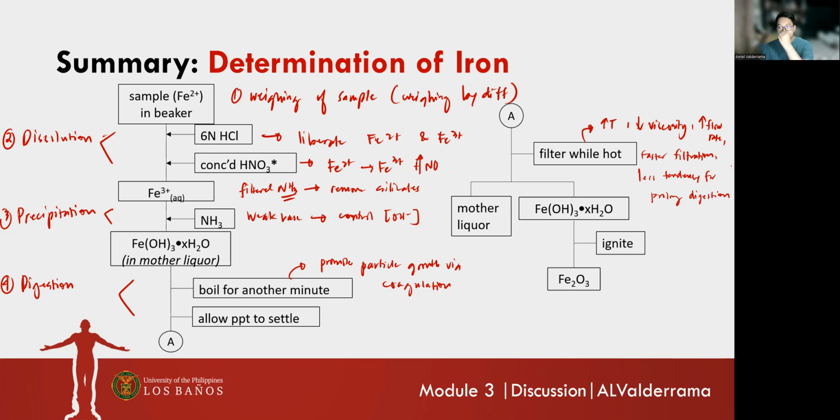Okay? So this is your step 5 and 6. Filtration and washing.